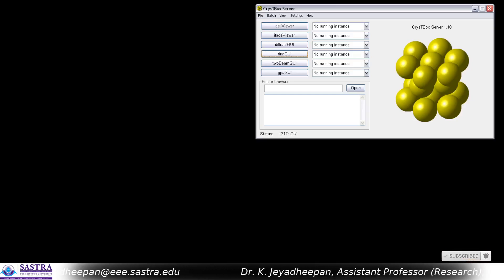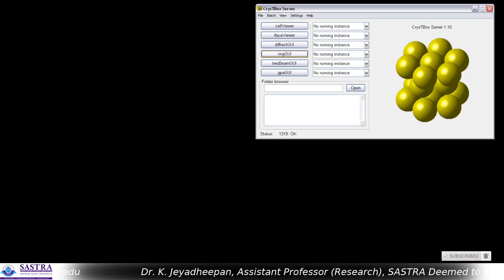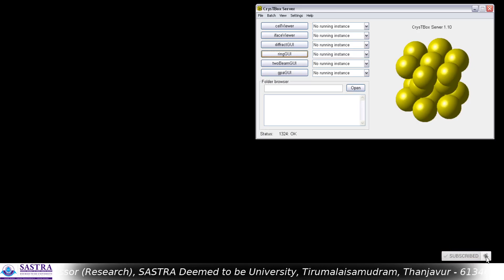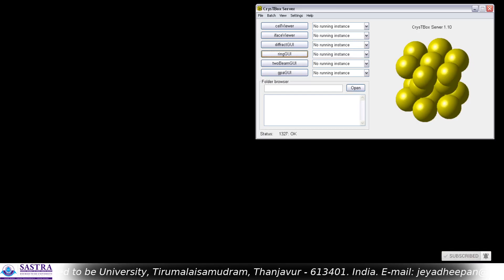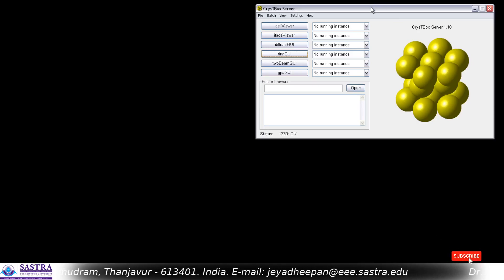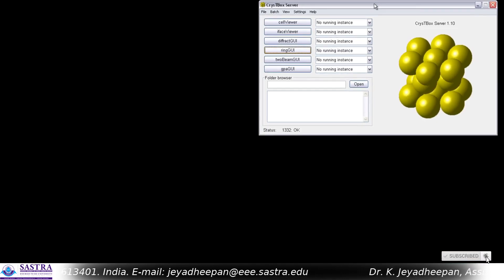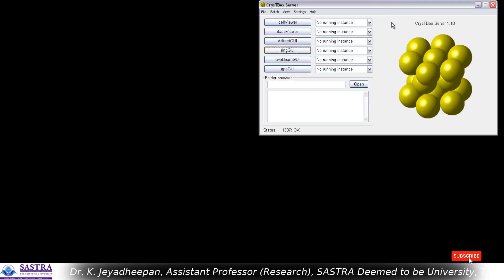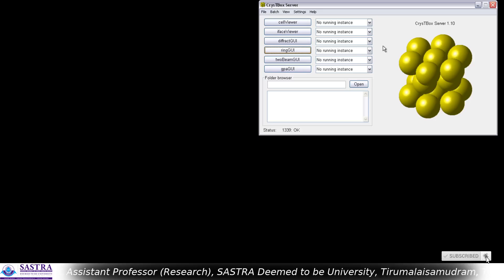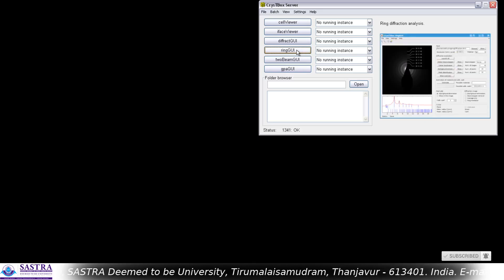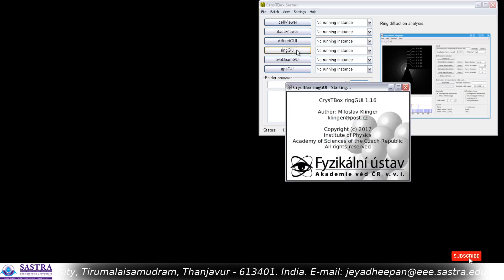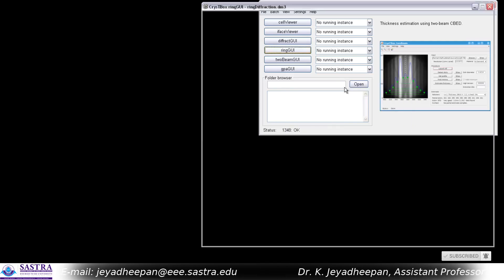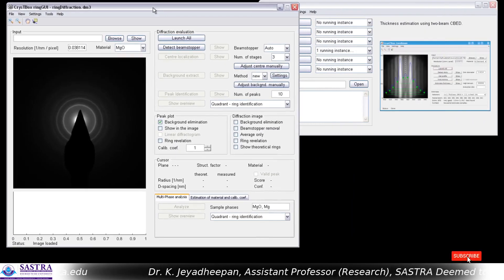Hello students and friends. In this video I'm going to show you a short demo on the indexing of ring patterns of selected area electron diffraction (SAED) analysis. For this I'm going to use one tool called CrysTBox. I am going to use the GUI called Ring GUI of the CrysTBox server, so I'm opening the Ring GUI.